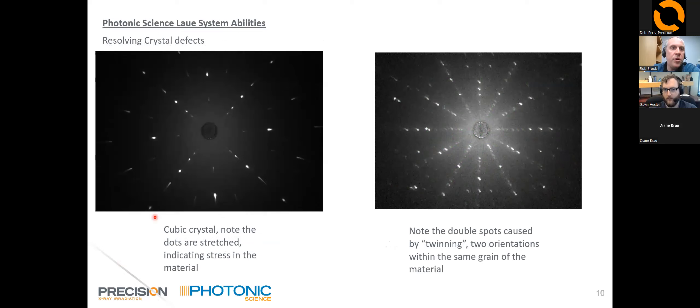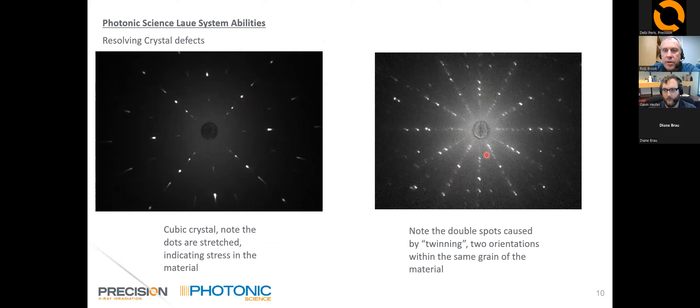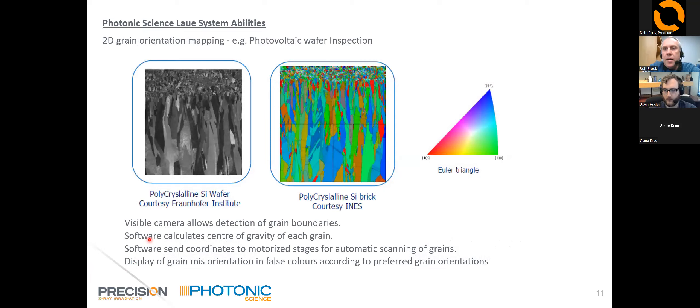You can also use the system to detect defects in your crystal. In this example on the left, a cubic crystal shows some spots have become stretched, indicating stress in the material. On the right, some spots have become double spots, caused by twinning — where you have two orientations of the crystal within the same grain of the material.